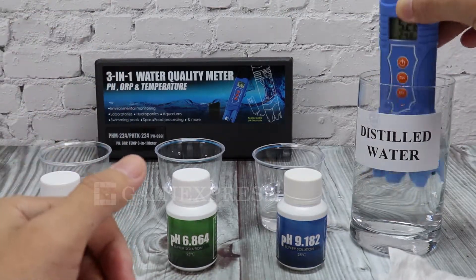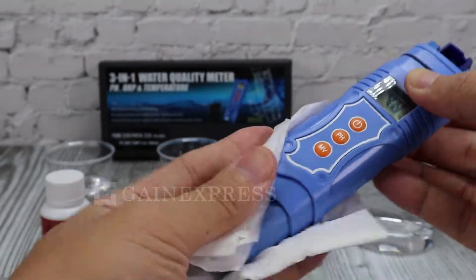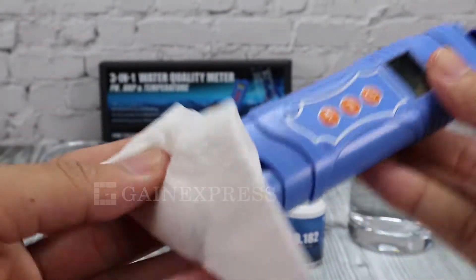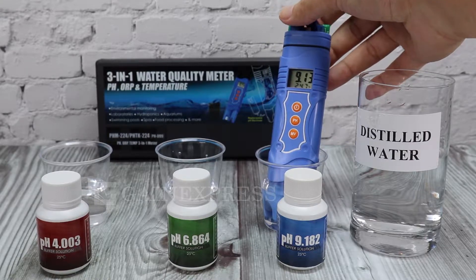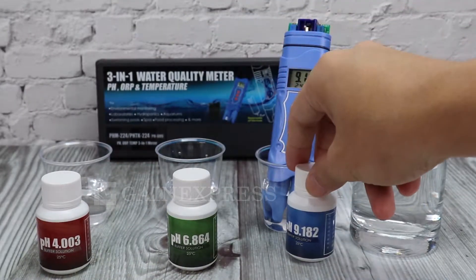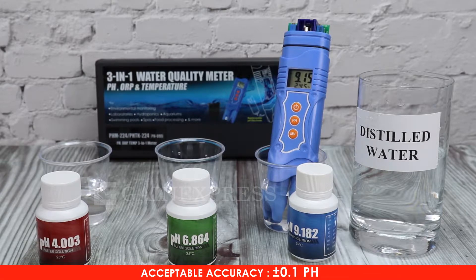Always use distilled water to rinse the meter after every use to remove the remaining solution. Dip the rinsed probe into the pH 9.18 solution. If the display value is within the accuracy range, it is acceptable.